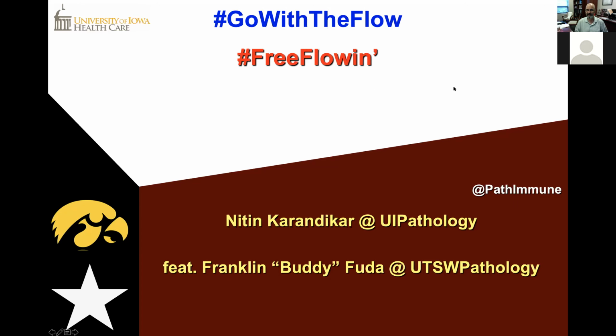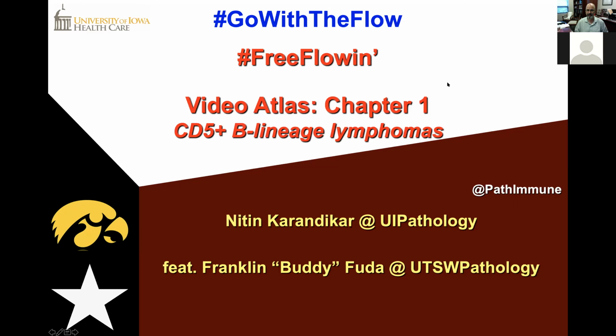For the very first one, we are going to focus on CD5 positive B-lineage lymphoma. Buddy is going to take us through that journey. The reason we are calling it a video atlas actually has history. Both Buddy and I have spent a lot of conversations about eventually doing a flow cytometry atlas. Buddy has been stashing away interesting cases for it.